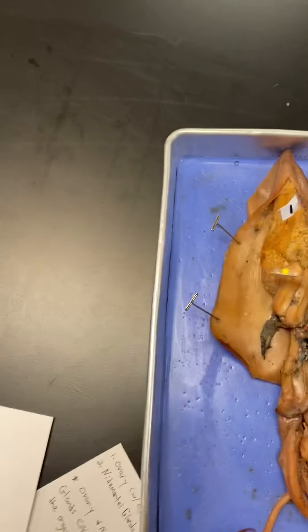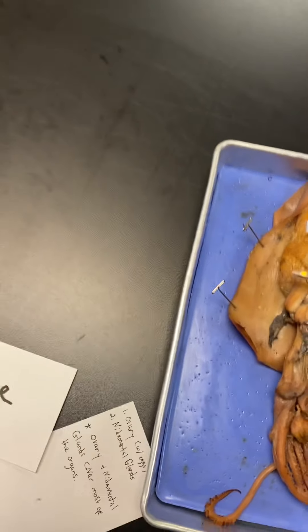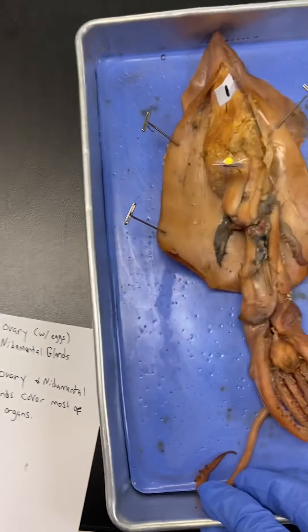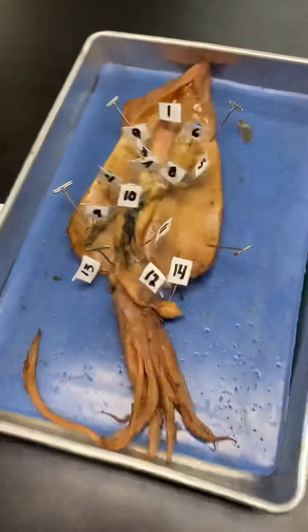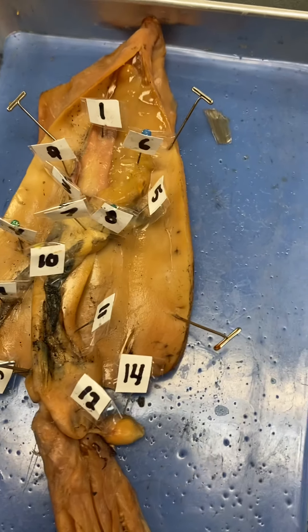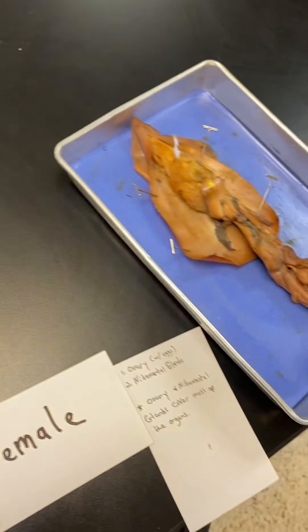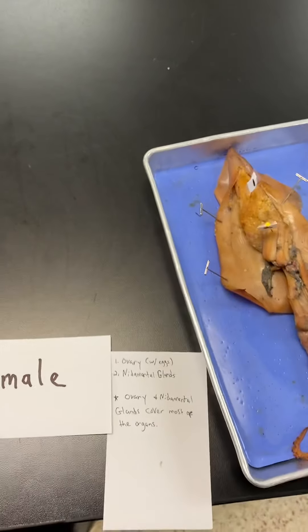The side that we cut into — this is ventral; the side with the siphon is ventral. The other side where you can see all the chromatophores, the darker side, that is dorsal. This area towards the head is anterior; more towards the tip up here where the fins are is posterior. So: anterior, posterior, ventral on the siphon side, and dorsal on the side with the dark pigmentation.